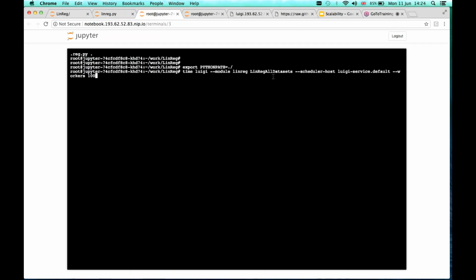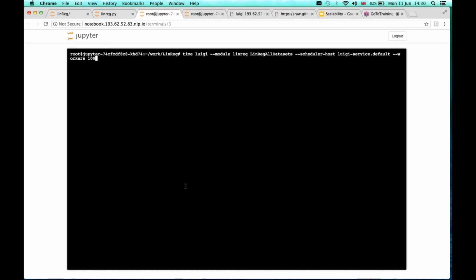Okay, and this scheduler host is the scheduler host that's configured under Phenomenal to host Luigi. So this minus scheduler host tells Luigi where to submit these tasks that we're going to run.